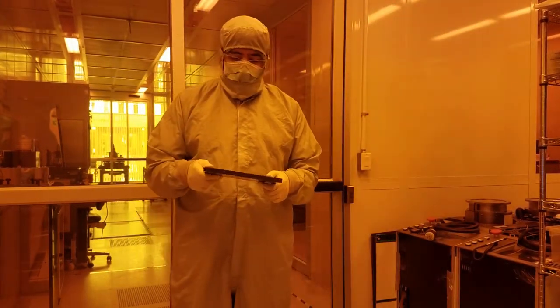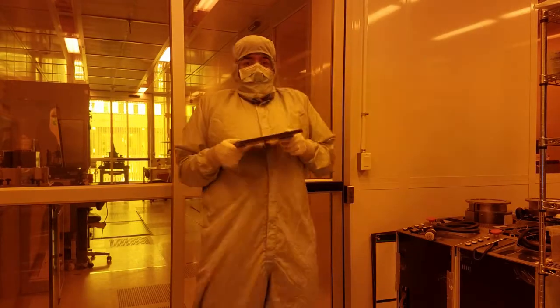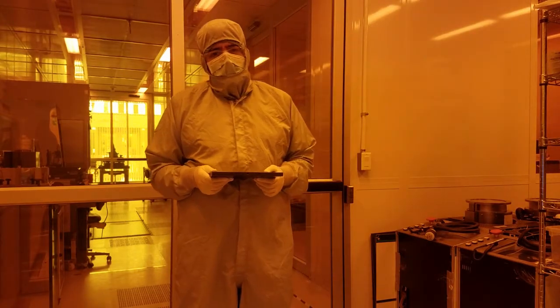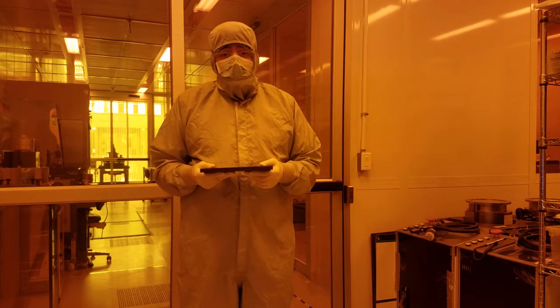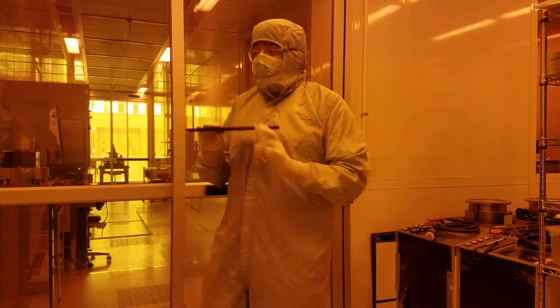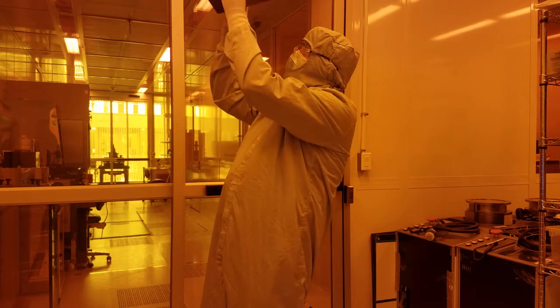Whatever you do, do NOT flip over the chuck! If you do that, you'll drop the pins on the ground and they'll end up beneath the floor and they'll be lost. If you really want to look on the underside of the chuck, look underneath it instead.